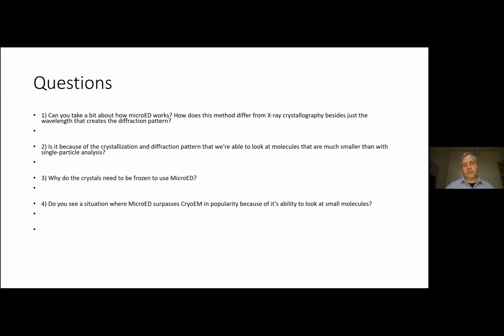Do crystals need to be frozen for MicroED? I would say protein crystals, or peptides, or things that are naturally hydrated need to be frozen, because they're in water, and if you put liquid water in the vacuum of the microscope, it'll immediately evaporate and probably crash the vacuum of the microscope, because it's volatile in the vacuum. So anything that has water in it needs to be frozen and kept close to -180, at least below about -150, so that it doesn't sublime in the vacuum of the microscope. That's why crystals of proteins or things that are naturally hydrated need to be frozen.